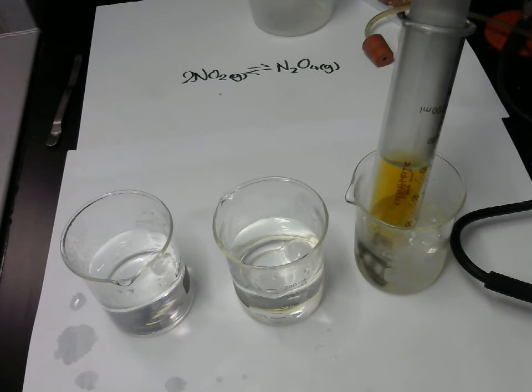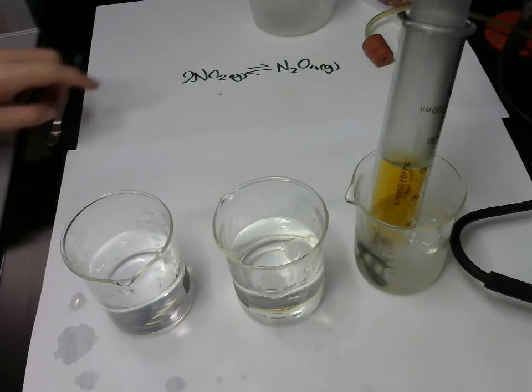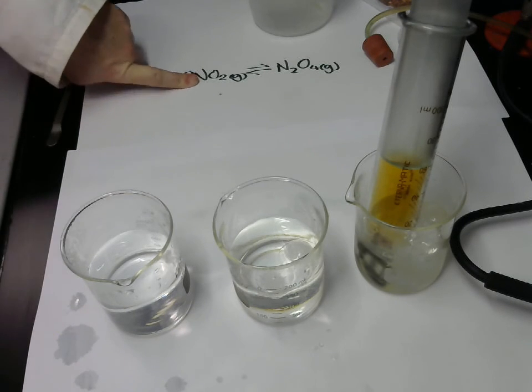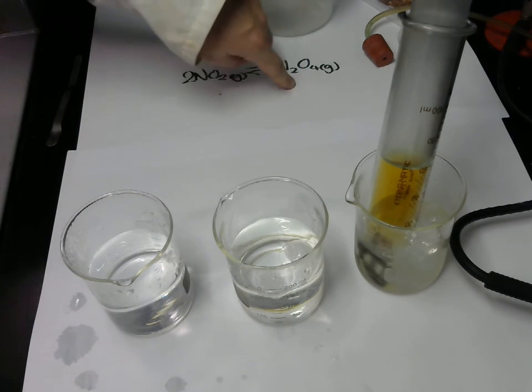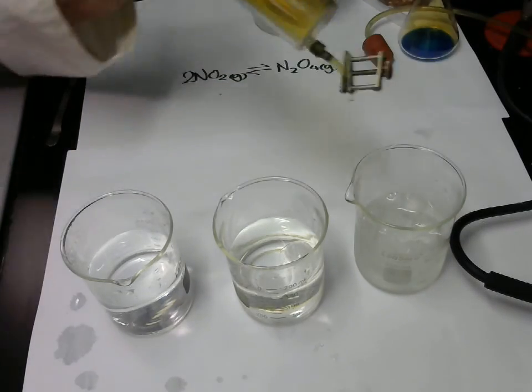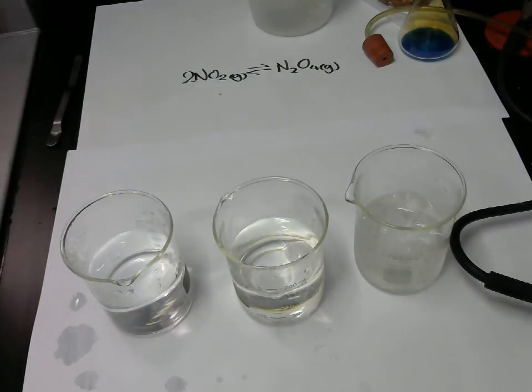But we also saw that if we change the concentration of something, we can also change the system. If I pump more nitrogen dioxide in there, it will initially go darker, nitrogen dioxide brown, but then if I close the system again, it will fade again. Because by increasing the concentration of a reagent, the system, to get back into an equilibrium, will make more of the product. So I'll go back to the original colour. There we go, that's better. That's a bit more of an obvious lighter colour. Okay.